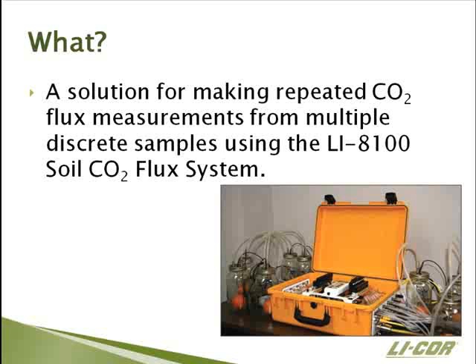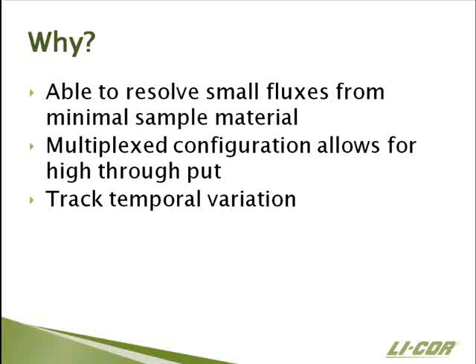So this leads into the why you'd want to do this. Well, the system's extremely sensitive. It's able to resolve small fluxes from minimal sample material. We took this system out and configured it based on some of the information I'm about to show you in a couple of slides, and we were actually able to detect carbon fluxes from a single fruit fly with it.